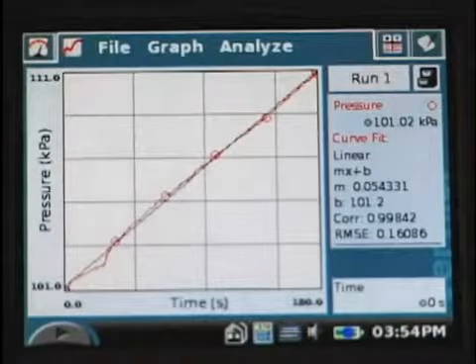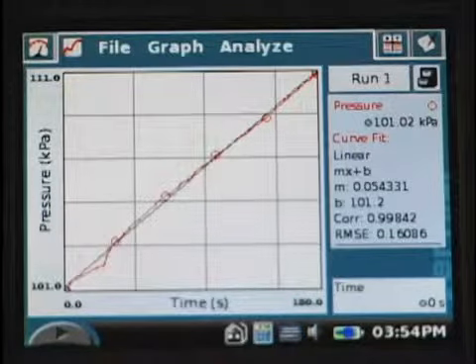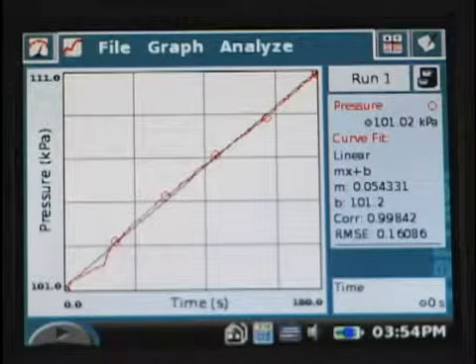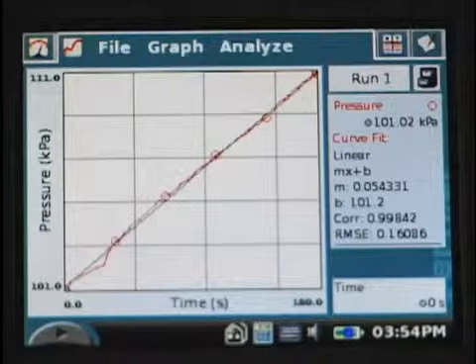You will repeat this experiment with different enzyme concentrations. In test tubes number 2, 3, and 4, you will put 2 drops, then 3 drops, and 4 drops of enzyme in each test tube.